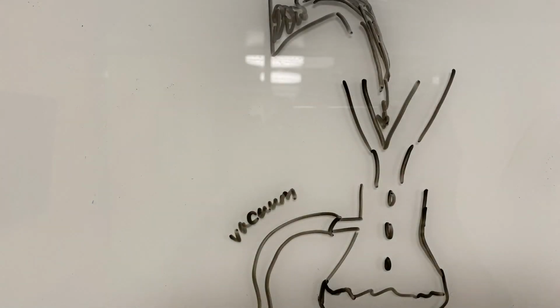Next, the solution, which was dark brown in color, was filtered using a vacuum to remove any impurities. This is essential to optimizing the process of recrystallization, as impurities disrupt the formation of the crystal structure due to the differences in identity and chemical properties. The filtrate appeared to be clearer in color than the solution being filtered.